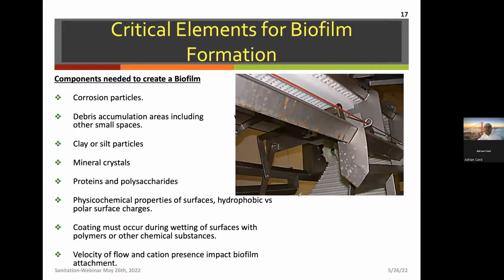When we talk about those biofilms, of course they're going to be benefited by what? By the type of material that we're using. So here is a cheap stainless steel that corroded pretty easily, and now you're creating all this pitting and debris that of course allows for the microorganisms to stay. Of course, there could be poor design like this one, in which you won't be able to clean any of these rolls that you see here. And so then the question is, have I cleaned these well?